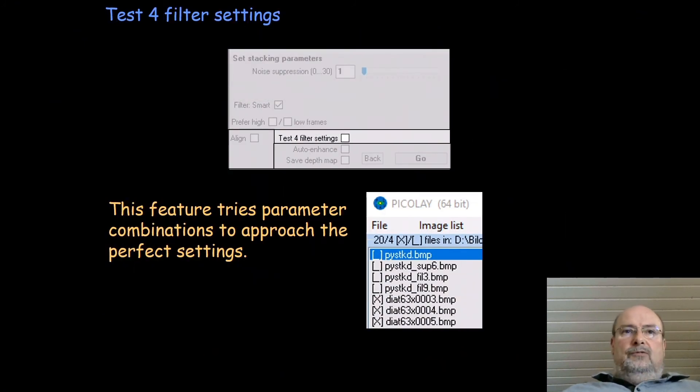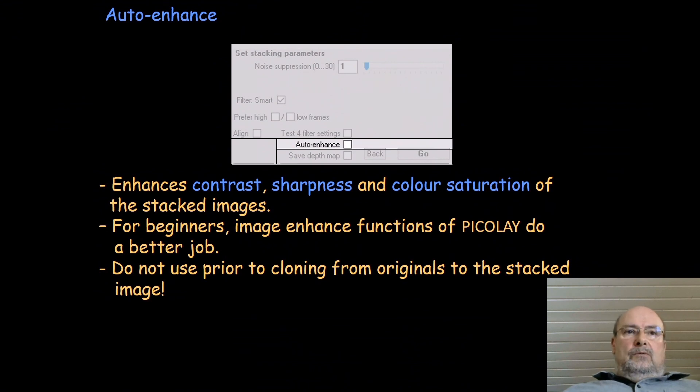One useful thing is this parameter: test for filter settings. It means just try out different settings of the parameters. This takes only very few time, it's a few seconds more. Then you have four different results: standard settings, noise suppression 6, filter of 3, and filter of 9. You can compare the results and that will help to find the perfect settings. It doesn't mean that one of these is the perfect one, but you can see oh, this is quite nice and close to what I would like to have. This is far away. It helps to get better results and it doesn't take much time.